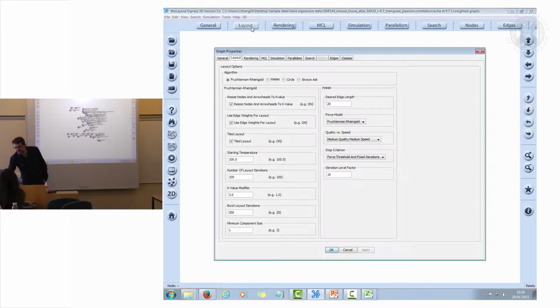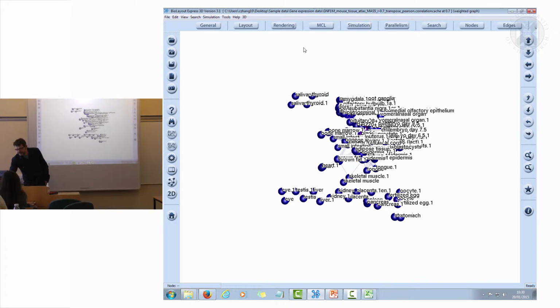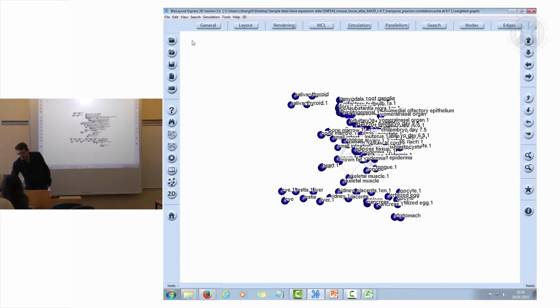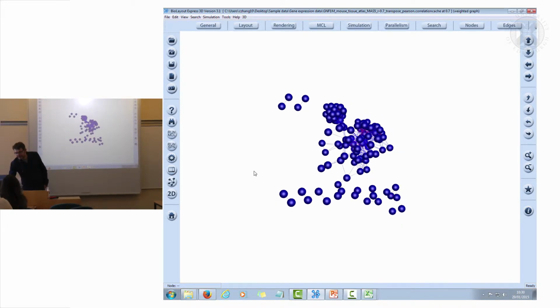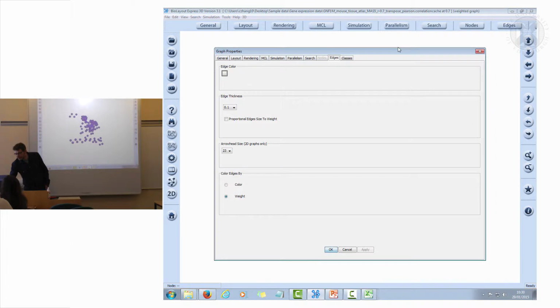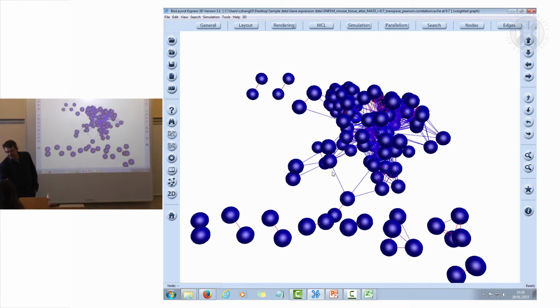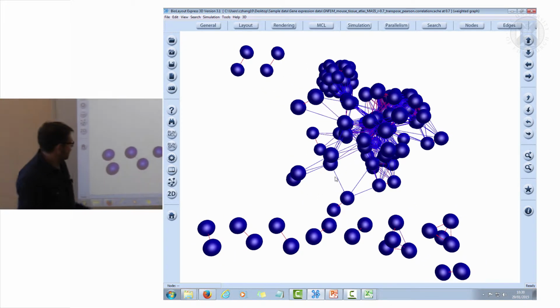So I just want to go into here a second and hide all the shot. Right, so just in graph speak, I'm making my edges a bit wider because you can hardly see them. Okay, so just a bit of graph speak.